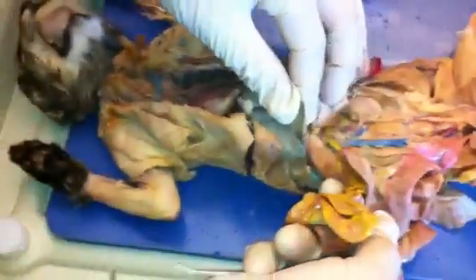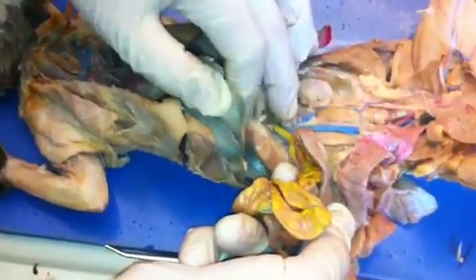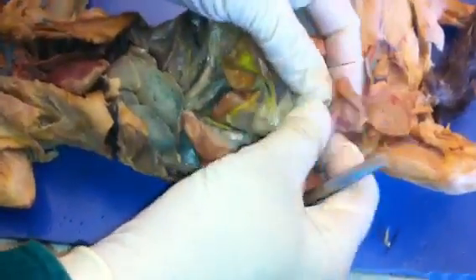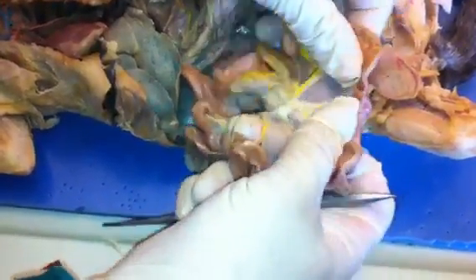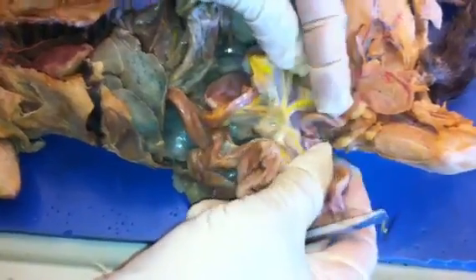And so the veins here are different. The company that preserved and prepared the cats for us colored all of the veins that lead to the liver with a yellow dye instead of a blue dye. And so every yellow vein you see here is leading to the liver, not back to the heart.